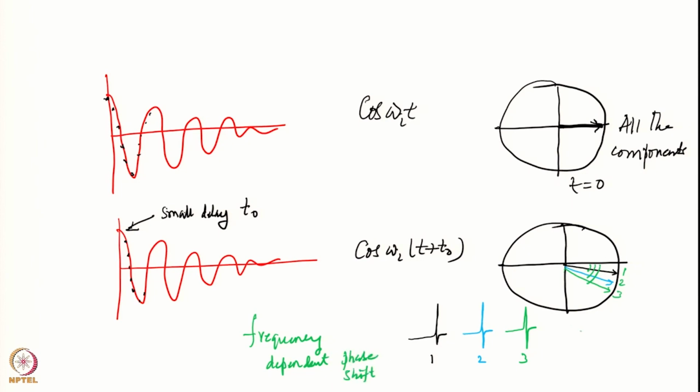And these are all in the real part of the spectrum. Similar thing will happen in the imaginary part of the spectrum. So in order to correct for this here as well as in the previous case, the strategy is to mix the real and the imaginary components, okay.